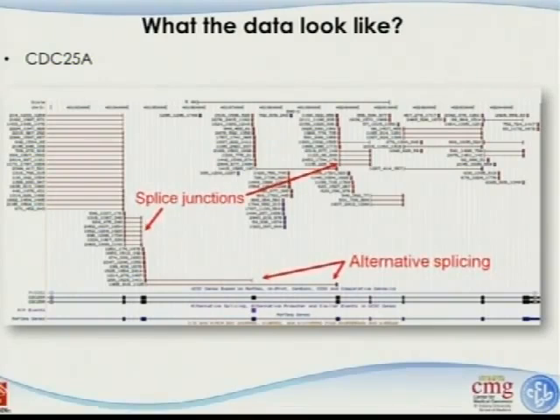Some reads support inclusion of the middle exon, others support its exclusion. And in the gene annotation, there are indeed two different isoforms, one with and one without this exon. So the data looks like this. If you see potential alternative splicing, it's not just your inference based on a certain level of accumulation, it is based on data you see with your own eyes, and that's more trustworthy to me.